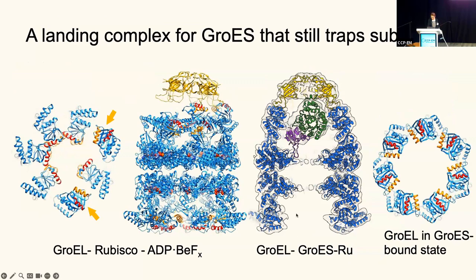And then he also got a few classes of the encapsulated rubisco. And this was quite nice because this is not the native structure rubisco. It's got two domains, and the folded state of the two domains at this resolution fits in, but the interface is distorted. And actually, one thing we heard about this morning, I think Wall was talking about hydration water around a protein.